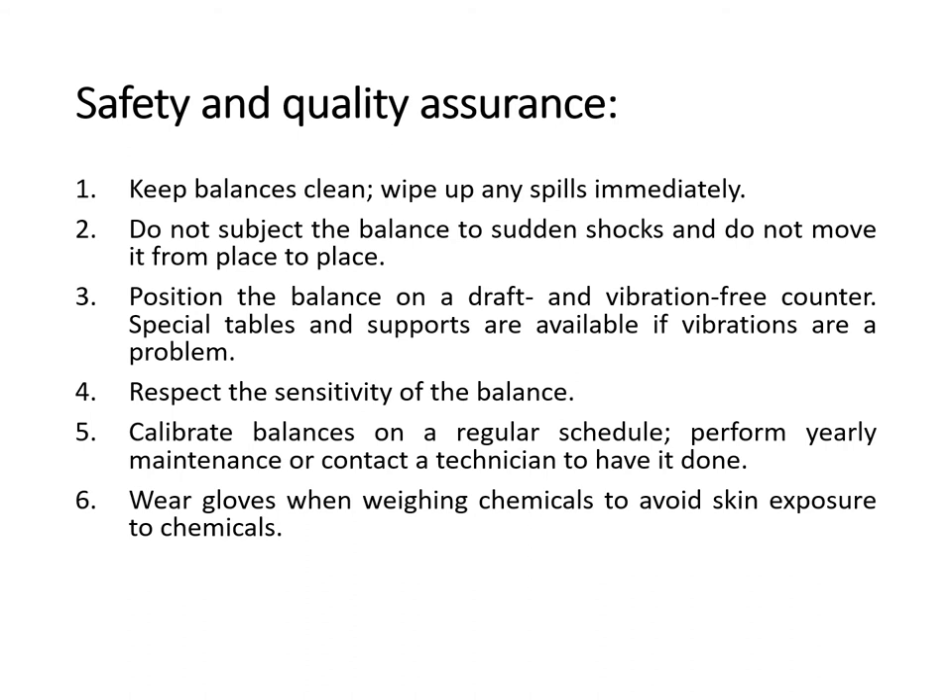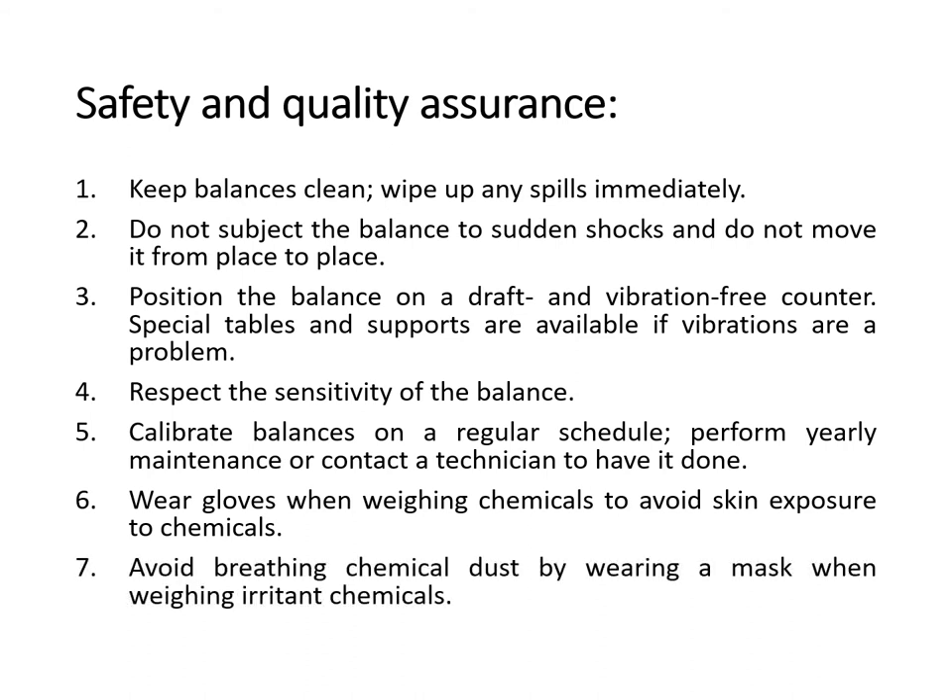PPE is still very important even if you're just weighing chemicals or materials using the balance. Seventh, avoid breathing chemical dust by wearing a mask when weighing irritant chemicals. It all boils down to the use of your personal protective equipment. Another equipment commonly used in any section of the laboratory is the centrifuge.